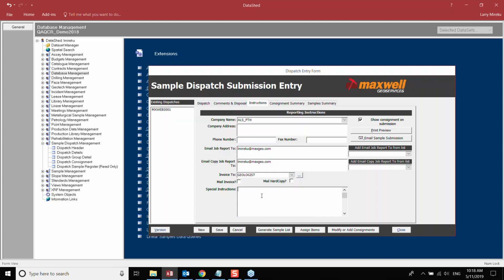And now here we can just put in additional information, testing for webinar. Okay. Now we're good to go, and we can save this. It's all saved. The next thing that we need to do is to generate a consignment.